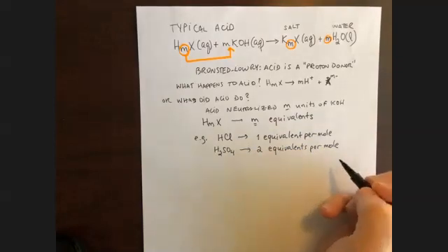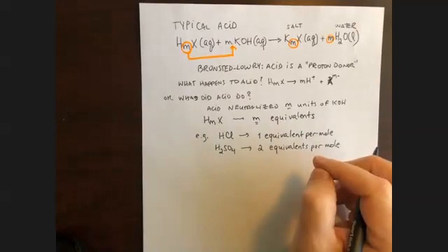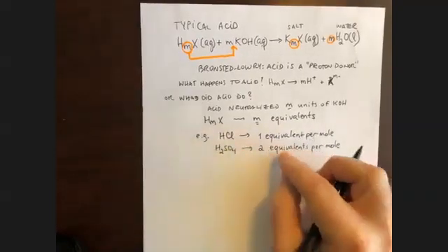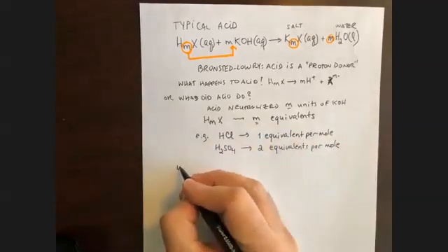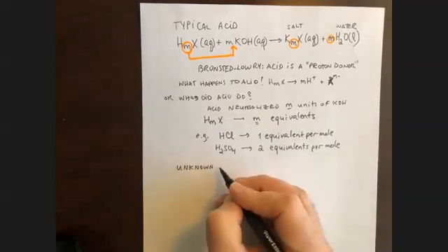In other words, when we look at the substance this way, we are not measuring how many units we have, but what kind of chemical power is contained in a sample of that substance. So let's say that I now have an acid of unknown composition. I don't know what this acid is.